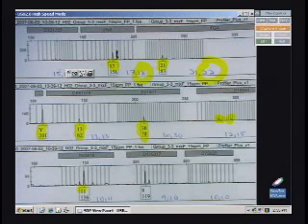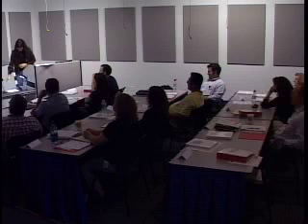You got the 11, but not the 10. Of course, there's a blip there. Don't know if it could be stutter for all we know. You got the 9. Well, the 10 looks like it was trying, and then maybe that little blip was the 10. Yeah, that was 15 cells.